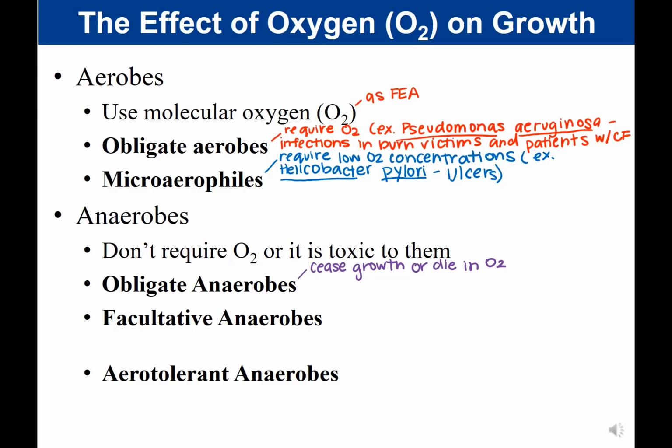Now, if you recall, Clostridium produces a structure when conditions become harsh or unfavorable. Clostridium would produce the structure to protect themselves. Now, in the case of Clostridium, that condition could be that oxygen is present.